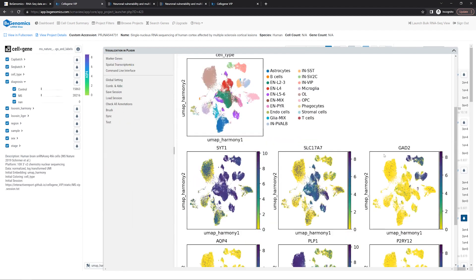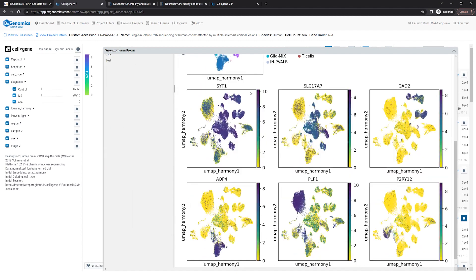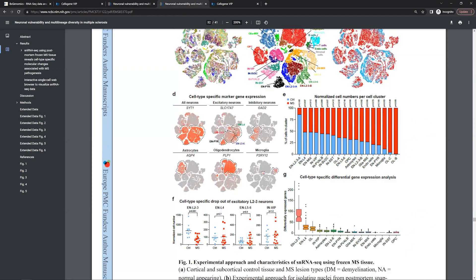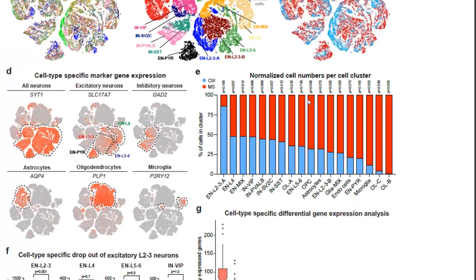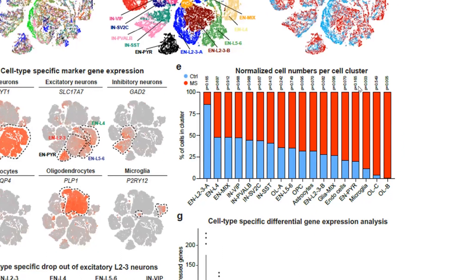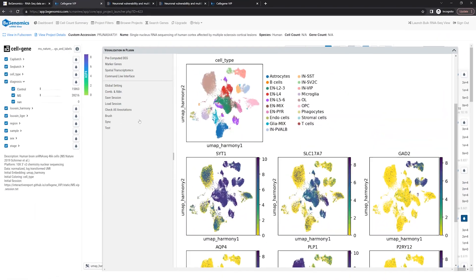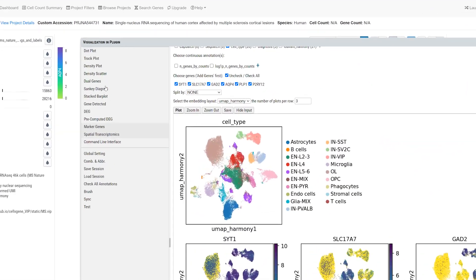These UMAP plots for cell type marker genes match with Figure 1D in the paper. We can also generate Figure 1E, which shows the percentage of MS and control cells in each cell type. In certain cell types, like microglia, a high percentage of cells are from MS. In Cell-by-Gene VIP, we can use a stacked bar plot.